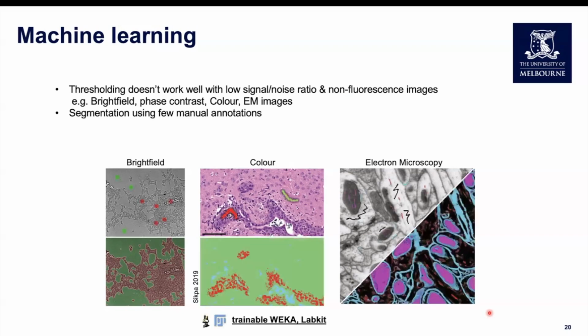And within Fiji, there are a couple of ways we can do this. So there is a trainable Weka way of doing this, and there's also something called LabKit, and we'll show you how to use LabKit as part of the hands-on activities. So again, really nicely interactive, very easy to use, no coding or programming experience required.